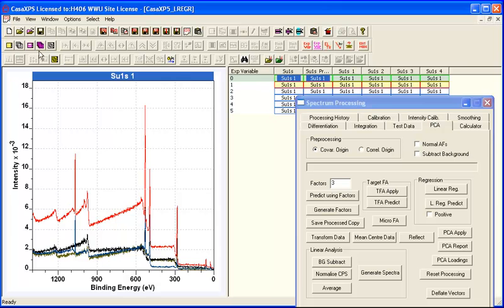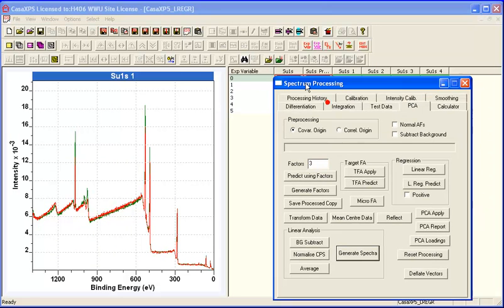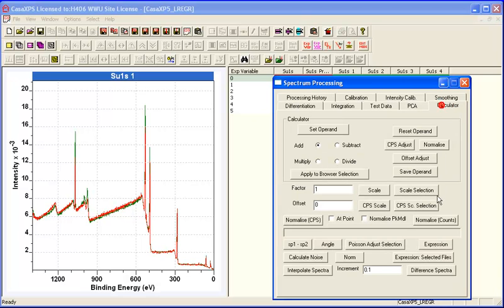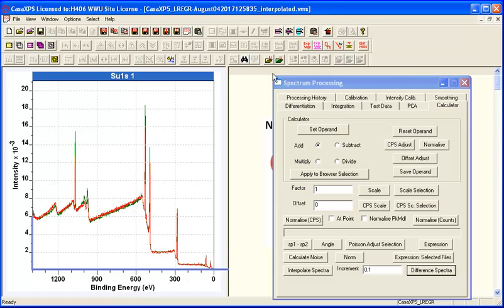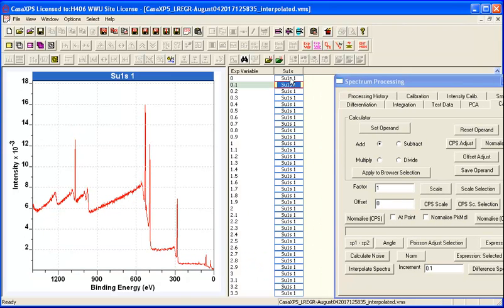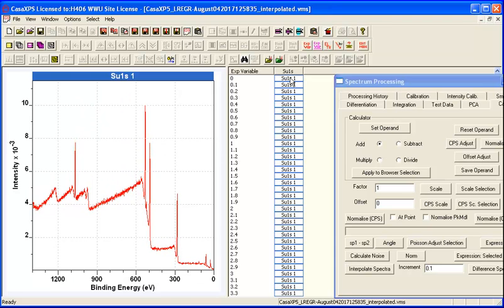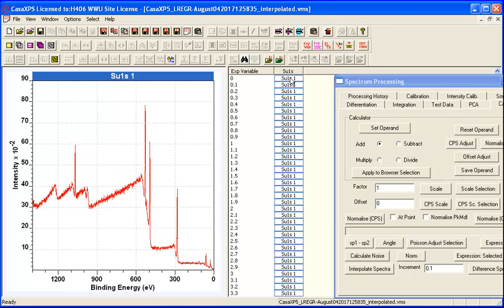So let's now go to the final one, the first one, that is, where there's a discrepancy. The green one is the least squares solution, the red one is the original data, and because the least squares solution cannot properly represent the original data, they don't overlay perfectly, and so this is the thing that allows a calculation of another different spectrum, which will hopefully work out the difference between these 2 spectra, and once we've done this we should get a good representation based on 5 basis functions for all 6.